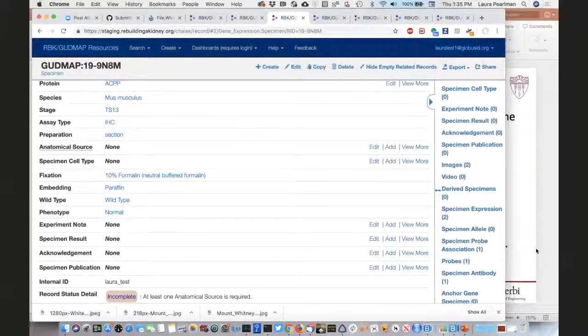Is there something else you wanted to say, Honsuda? Yes. So basically, what I'm trying to suggest is that it would be very helpful for you to go over the table of contents and then see which relevant information you think should be added associated with your specimen. For example, there's basic acknowledgement.